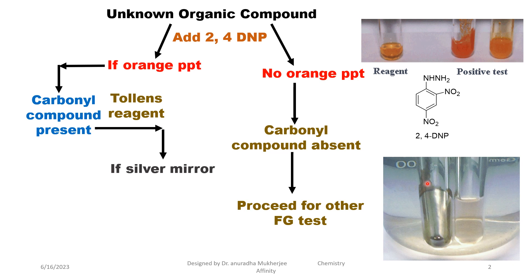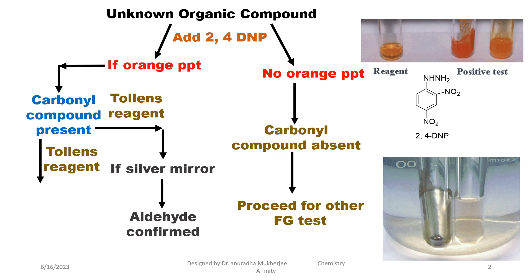Now after adding Tollens' reagent, if we get a silver mirror like this, that means this carbonyl compound is an aldehyde. But after adding Tollens' reagent, if you are not getting any silver mirror or any gray precipitate after heating, then the carbonyl compound is a ketone.